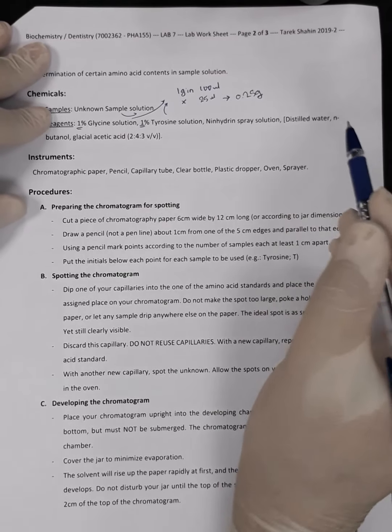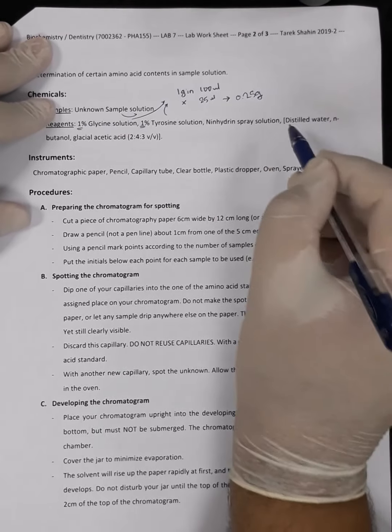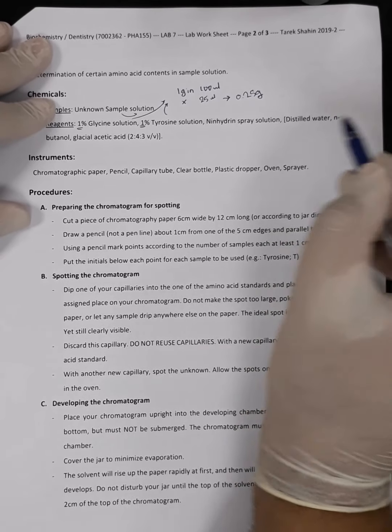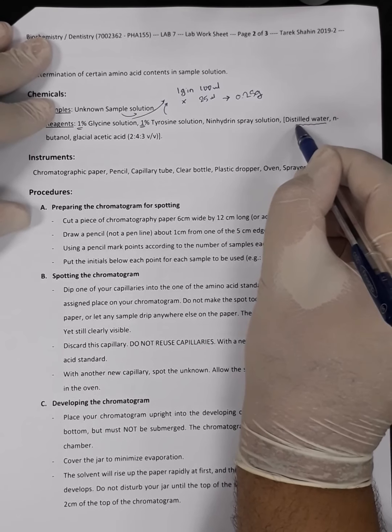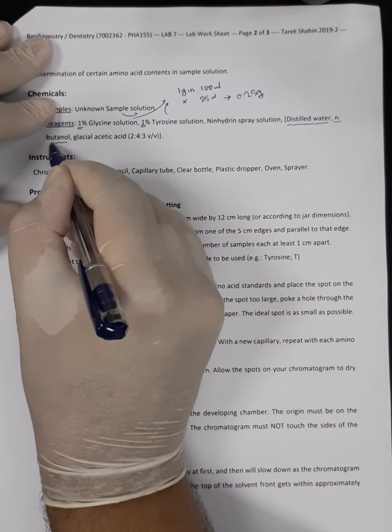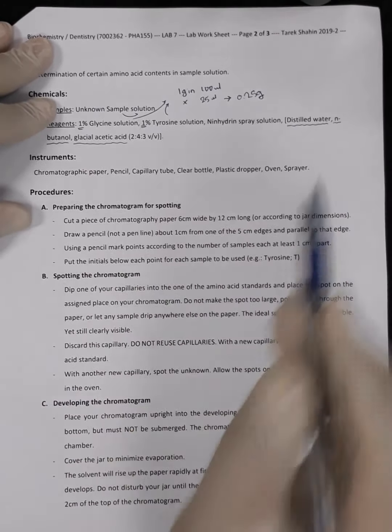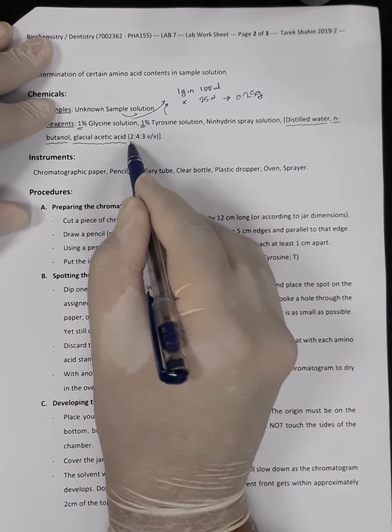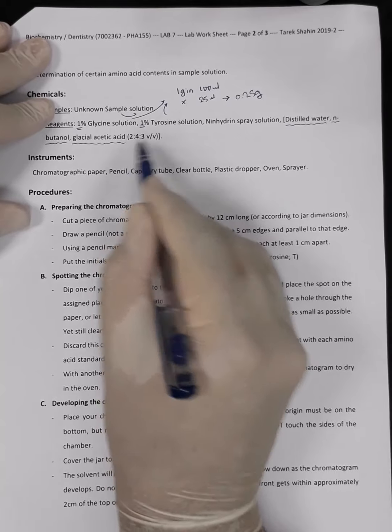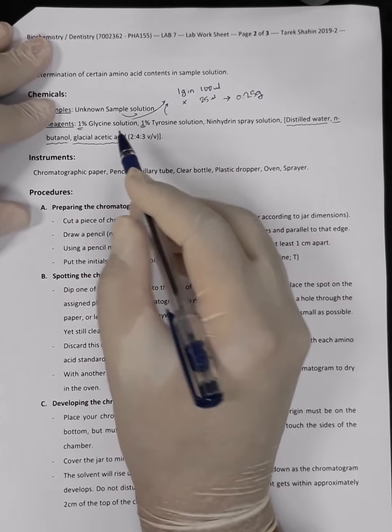Okay, now we are going to prepare the mobile phase. So how do we prepare the mobile phase? The mobile phase is composed of 3 chemicals. One of them is distilled water, the other chemical is N-butanol, and the third chemical is glacial acetic acid, as you can see here. The ratio between them is 2 to 4 to 3. It means 2 parts of distilled water, 4 parts of N-butanol, and 3 parts of glacial acetic acid.